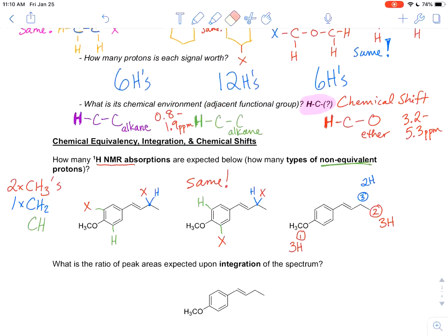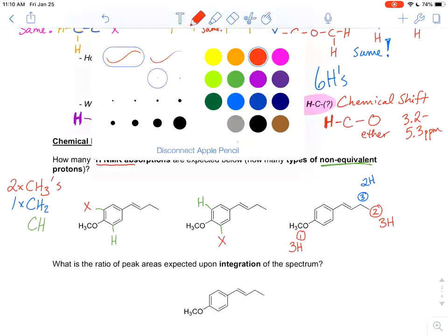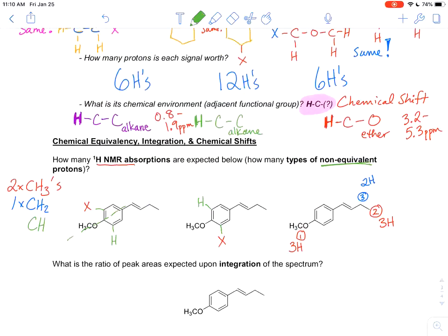In order for this to actually make sense, I need to remove these, and I'm trying to figure out if those two are the same compound, because you can do some rotation, and there's symmetry in the molecule, so even better, we see that there is symmetry here through the molecule.